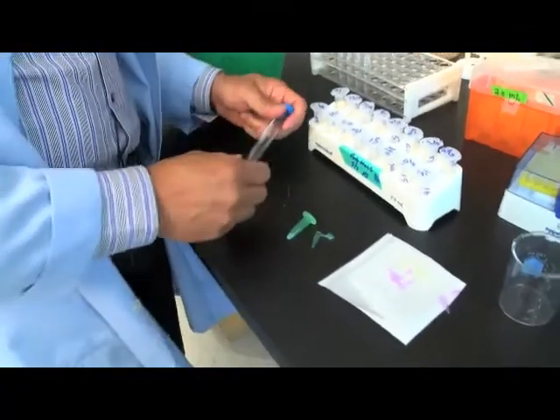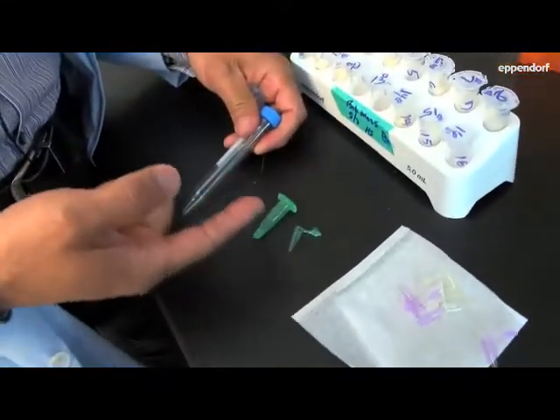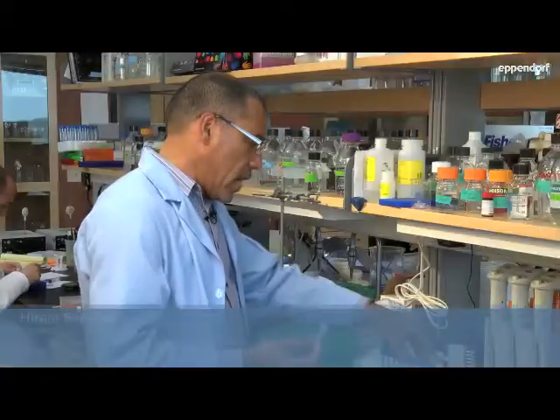Before, all we had was something like this — a 15 mil tube — and obviously there was a gap between these sizes. And you see the difference: I'm not wasting all that plastic, which is good for the planet.